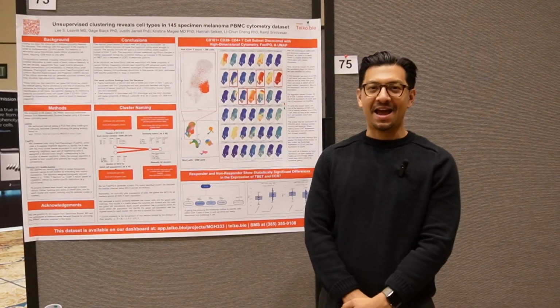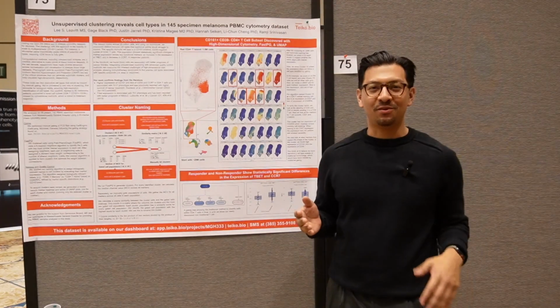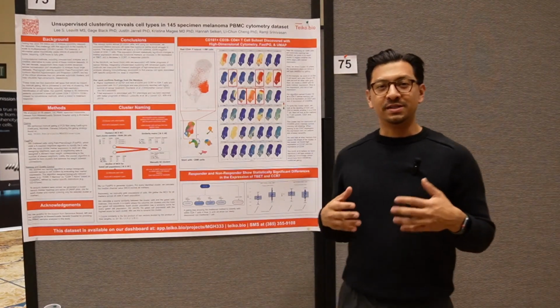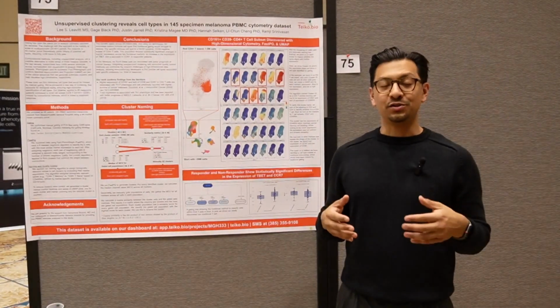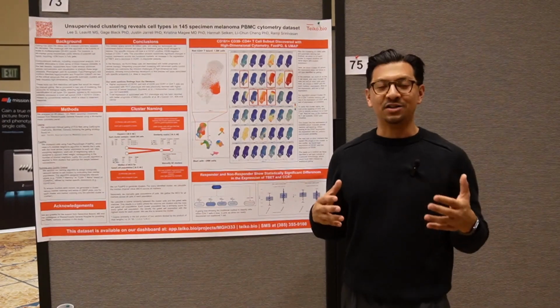I'm here today at the SITC Spring Scientific Conference in San Diego, California, and what I'm going to be presenting today is our recent work where we performed unsupervised clustering analysis to identify novel immune cell types that are associated with response in melanoma patients treated with anti-PD-1 therapy. This work we've done is in collaboration with Dr. Boland at Mass General Hospital.